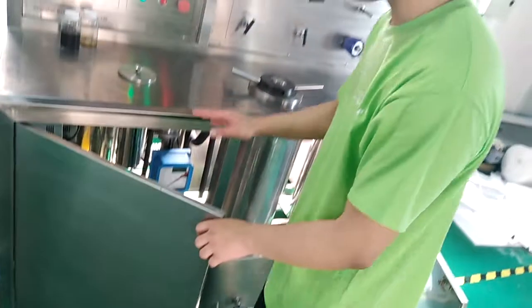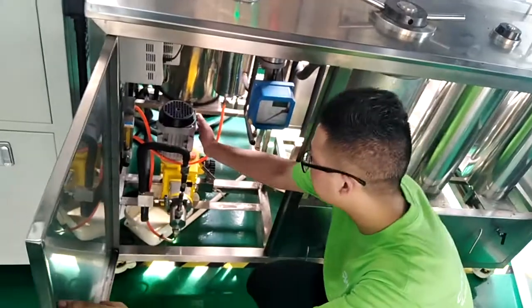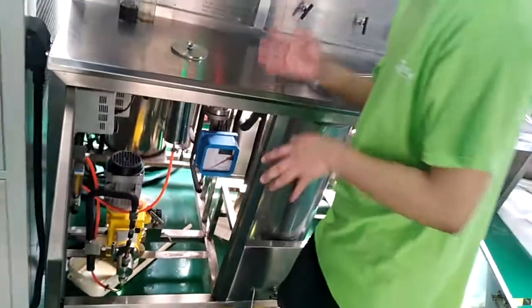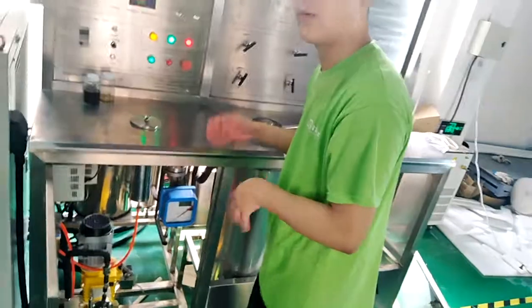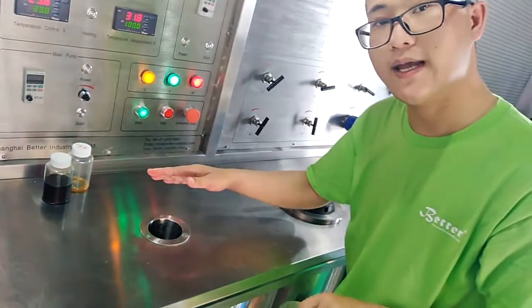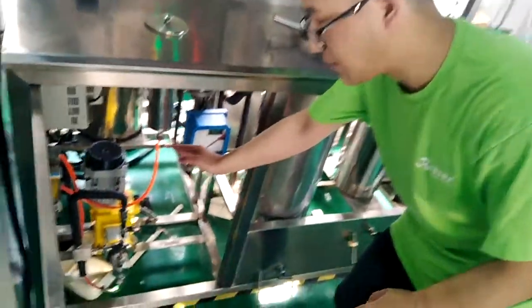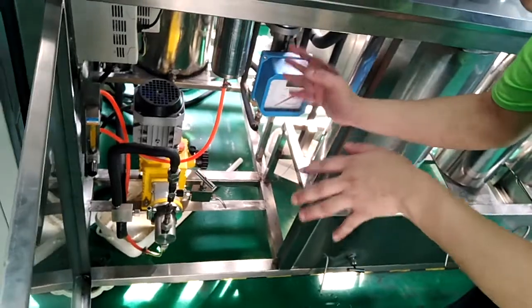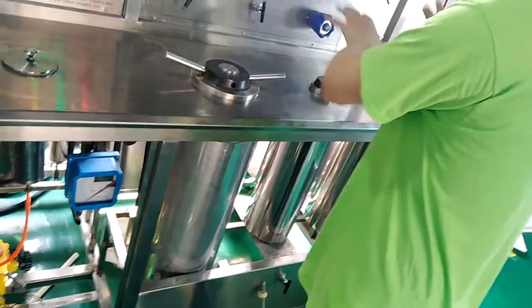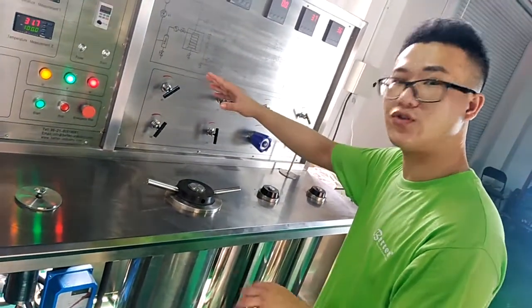There is another pump for the machine — it's called the co-solvent pump. It's the yellow one. When you want to clean the machine, generally we add some ethanol from here — this is the co-solvent storage tank. We add ethanol here, then we run the co-solvent pump. The pump will put the ethanol into the extractor and run it through, so the whole machine will be cleaned.